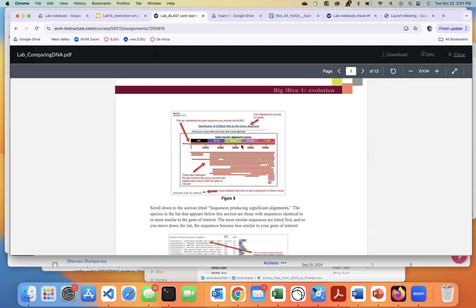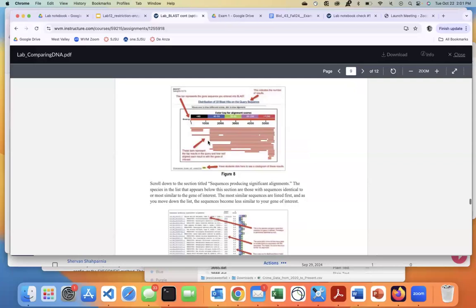Remember, this is when I show you guys the different alignments. So this is where your isoforms are. This is telling you that this right here for your query is about 5,500-ish, so 5.5 kilobases. And this first strand is like the whole thing, this whole mRNA. But you can see that the second one and third one are a different isoform, right? Because it has this segment, but then there's a bunch of segments right here that are blank, where it did not match. So it didn't have those segments in that particular mature mRNA. And then the fourth one and fifth one don't have it at all.